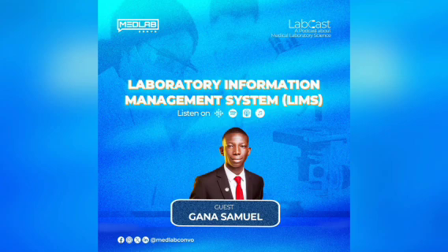Because of that, it opens an opportunity for those people who have medical laboratory science training and also IT training to know whenever the system is overloaded or becoming faulty. External support may not understand the science behind some things that are going on. So, again, an MLS, please. All right.